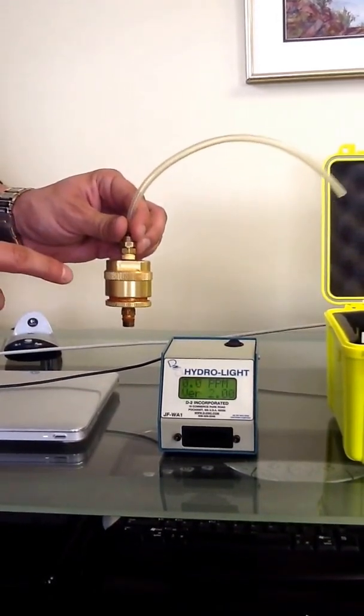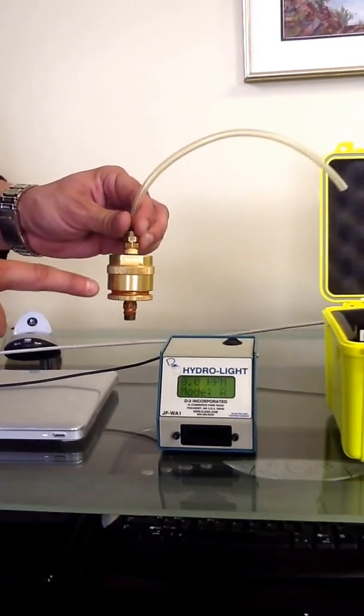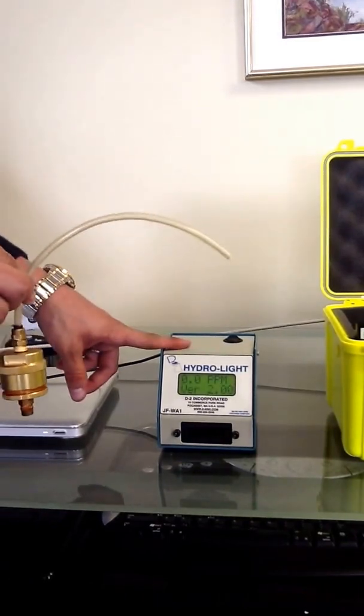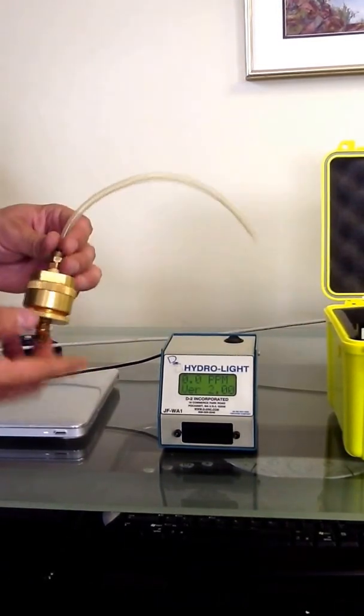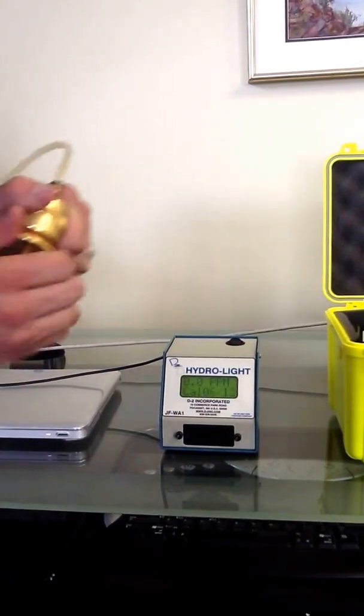Any undissolved free water in the fuel will interact with the color of the pad, changing the fluorazine dye. And our device is going to read that change in the color. So as you can see here, we've already run this pad. I'm going to take it out of the device.